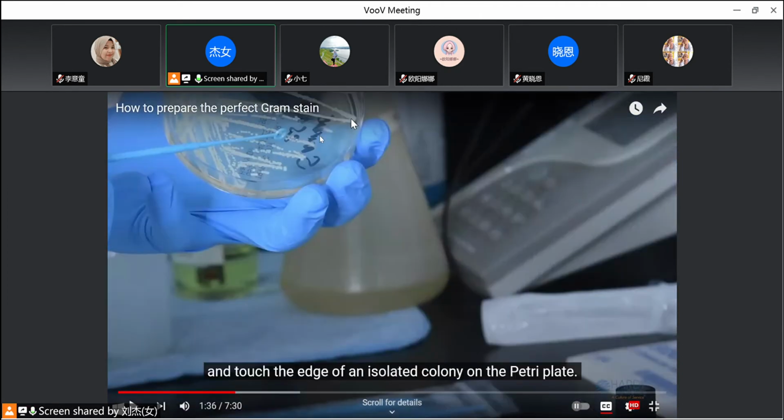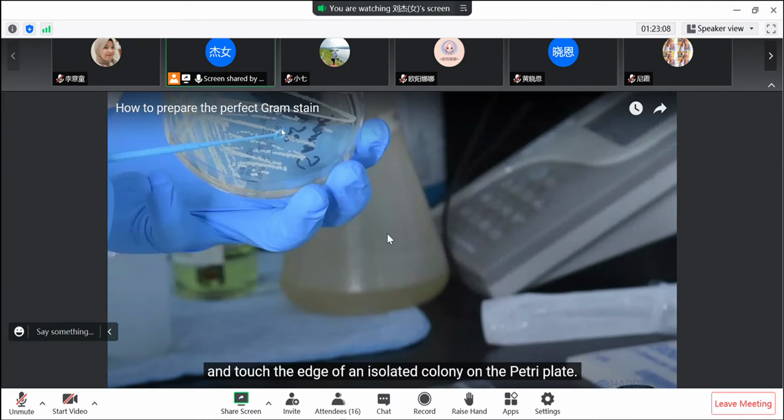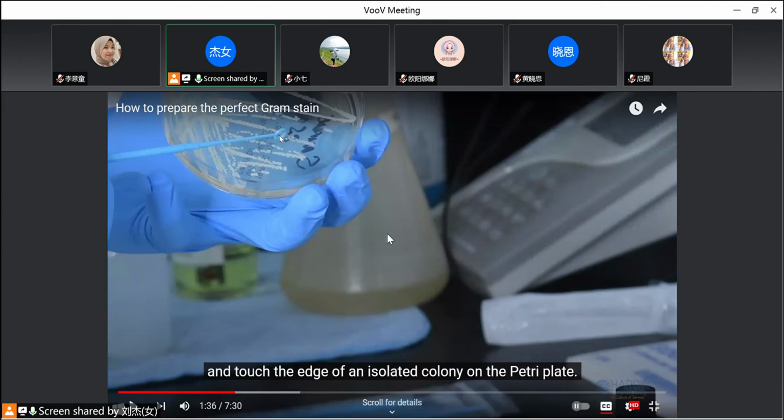Then he opened the plate, and you see he used a tool. This tool has a circle on the top, and you use this area just to attach the bacteria. However, if the sample is from the patient, such as the fluid of the patient or the wound of the patient, taken from the surface of the patient, it is the same.